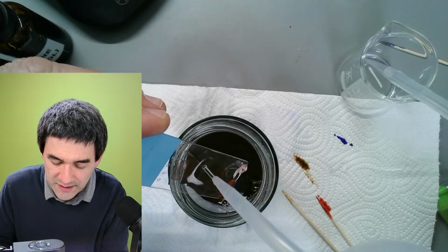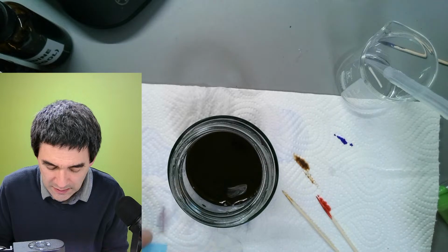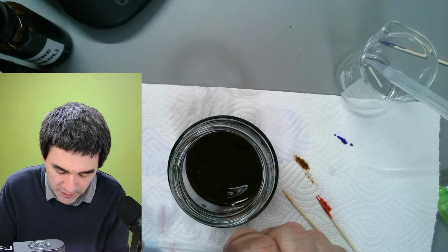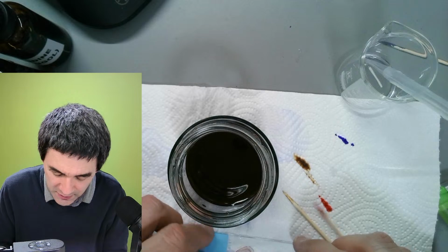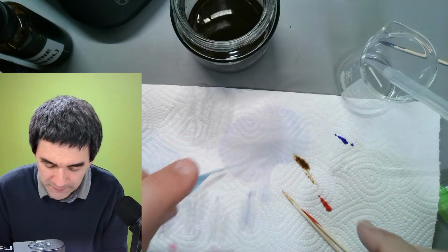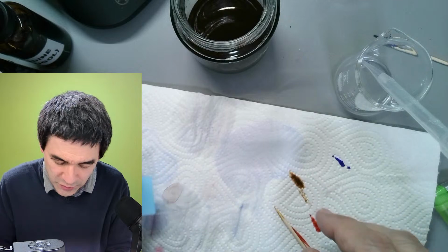I'm going to rinse this again. Okay, and here we go, and we're going to see at least the E. coli one. If it were a pure culture, it should be completely red. The other one, I don't know. It also looks red now. So maybe both of them were Gram negative.